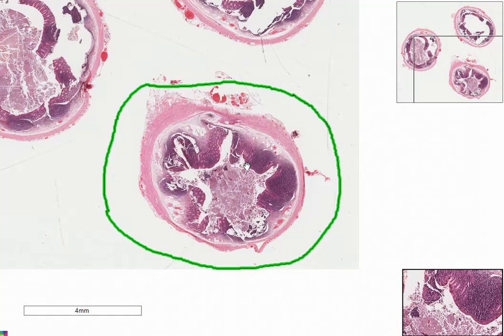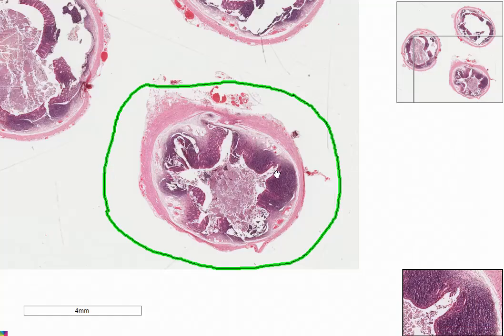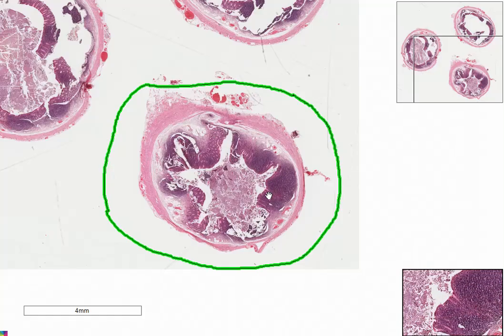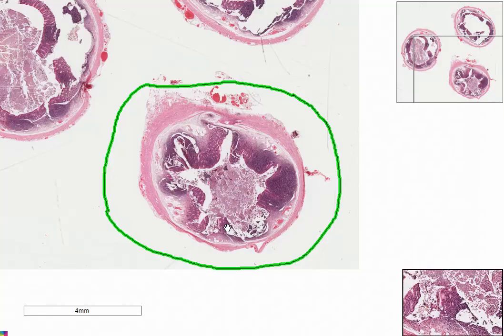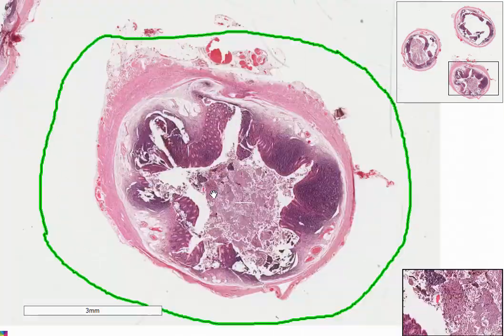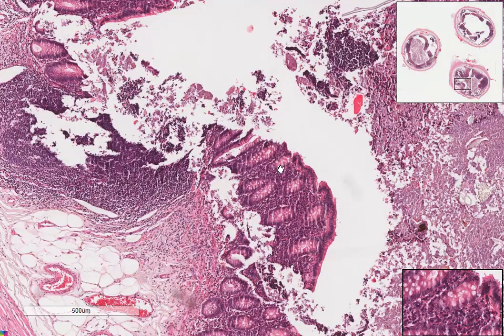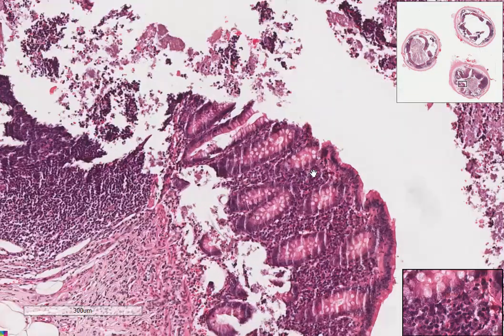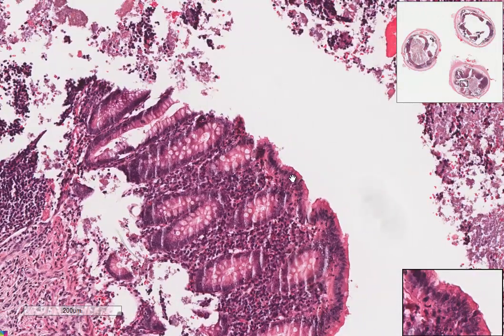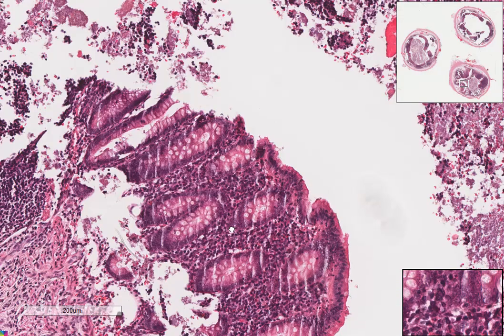And we have a mucosa. If you remember, like every GI organ, there is a mucosa. And then deep to the mucosa, we've got a lamina propria, okay? And the epithelium on the mucosa is simple columnar. I forgot to highlight that. It's a simple columnar epithelium, and it's got crypts almost like colon tissue.